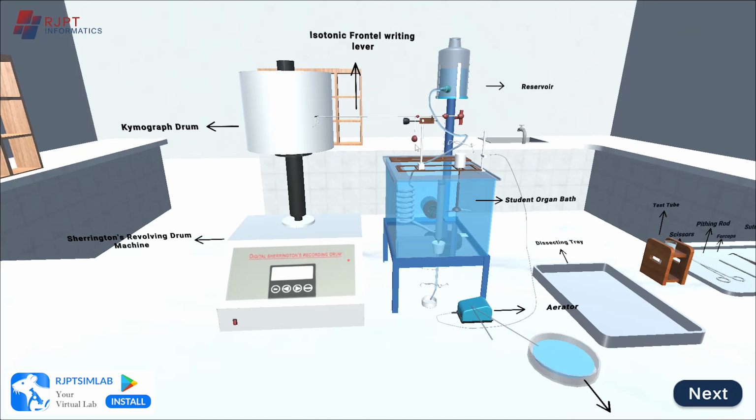The frontal lever is attached to a counterweight balance, so that the movement of the frontal lever is possible upward and downward. And while we hang our tissue to the frontal lever, the balance equilibrates the weight, so that it does not hang up while hanging the tissue.